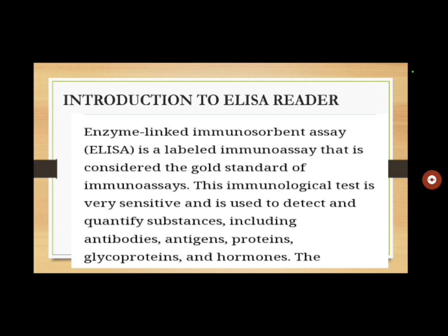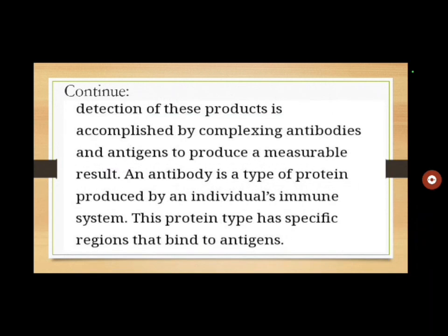This immunological test is very sensitive and is used to detect and quantify substances including antibodies, antigens, proteins, glycoproteins, and hormones. The detection of these products is accomplished by complexing antibodies and antigens to produce a measurable result.